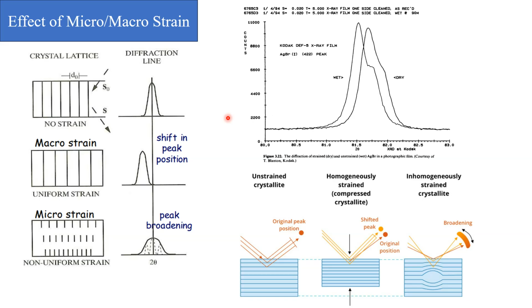So it is important how we prepare our samples or what the synthesizing method is. Like when we ball mill or mechanically mill our sample, there will be a mixture of loads applied on our sample. So there will be a complex situation for our samples, and there will be a shift in peak position in addition to peak broadening in our XRD pattern.